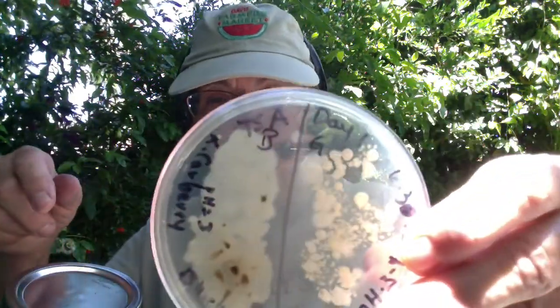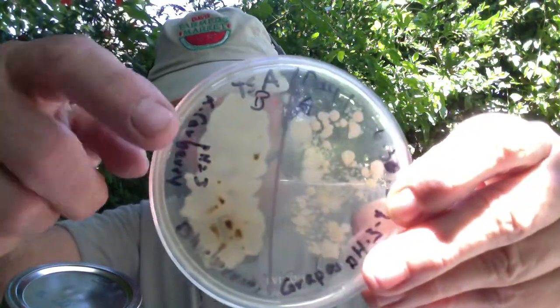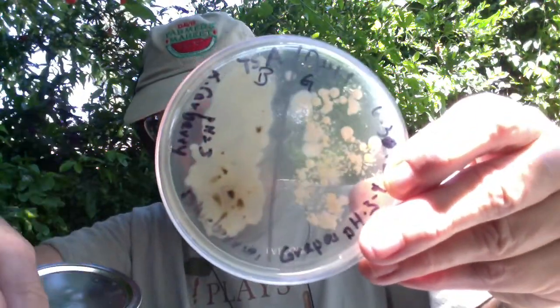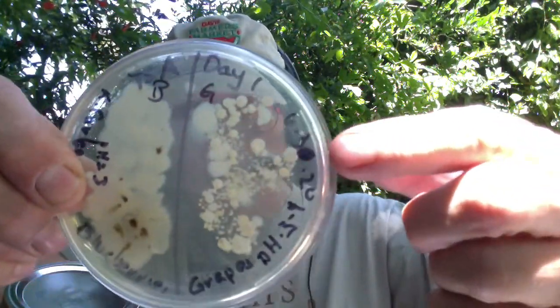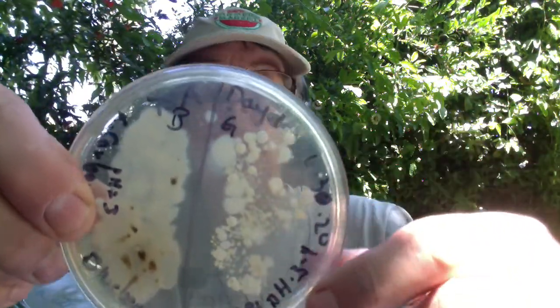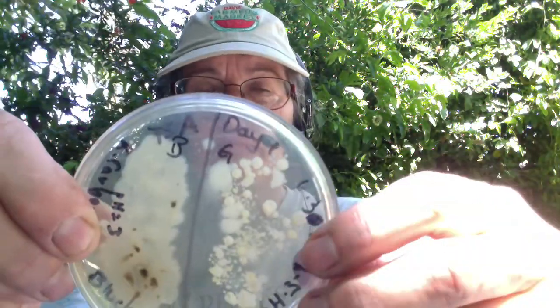But just to review, you guys, we were sampling, transferring the microbes from the blueberries to the grapes each day. So I'll first do the TSA plates, and recall TSA is an all-purpose medium. It'll grow a wide range of both bacteria and fungi, including yeast. So here, folks, this was our blueberries, and you might recall that the blueberries were just so chock full of microbes. All the colonies grew together. We got confluent growth here. And then the grapes, this was the surface of the grapes. We can see the grapes didn't have as many microbes, but still quite a few, right?